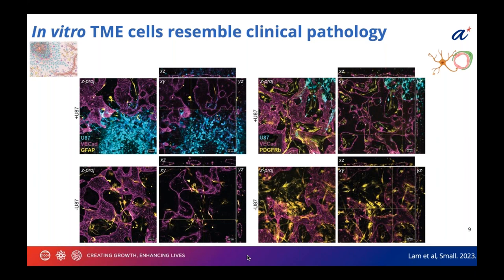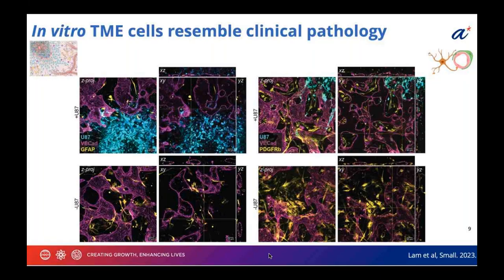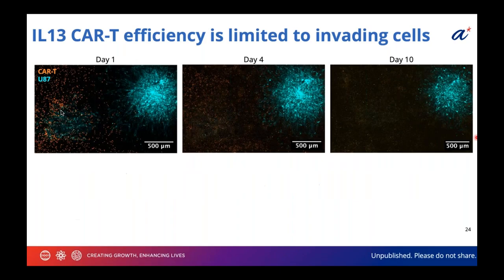The next question is, what's the best way to do migration assays using spheroids and testing the migration of certain marked cells towards the spheroid? I'll use this slide to reference everything. If you look at these three images, they're the exact same tumor over 10 days. Because we have essentially an optically clear device with a very thin film at the bottom, that allows us to do live imaging, long-term live imaging. So you can do continuous assaying.